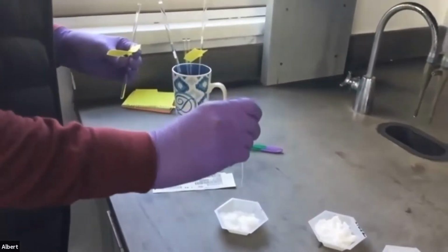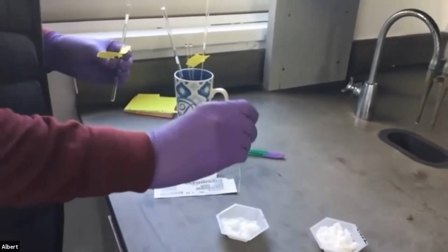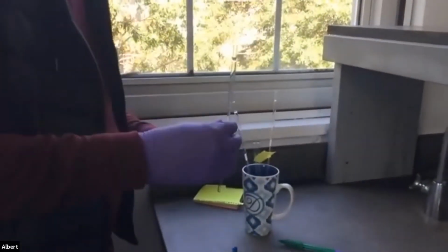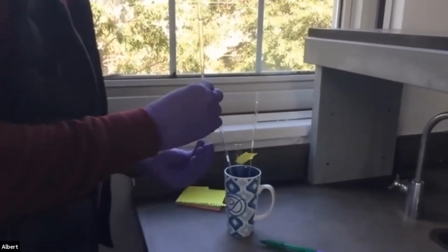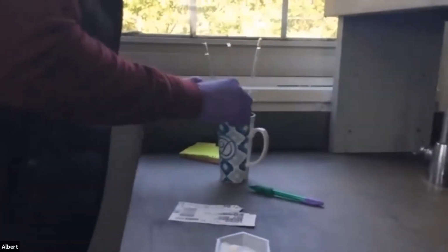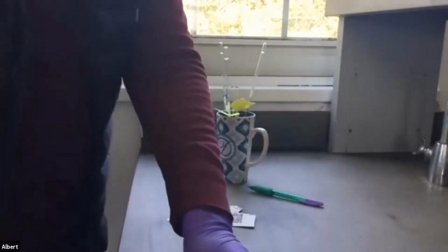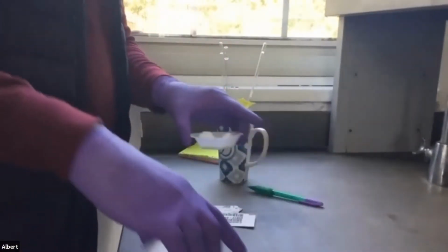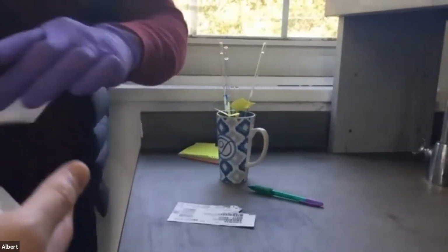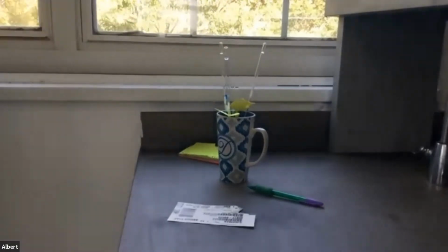You can tell I did this for several years out of my life as a grad student. If you're an organic grad student, this is all you do, make stuff and take NMRs and infrared and mass spec. We have a mass spectrometer too, but we're not going to do mass spec because that instrument is a little bit more difficult to use. All right, so we got that. So what I'm going to do, can you put these back in the drawer up there that says Wednesday? If you open it up, Wednesday is actually written in the drawer. All right, so what I'm going to do is real quick clean off the FTIR.